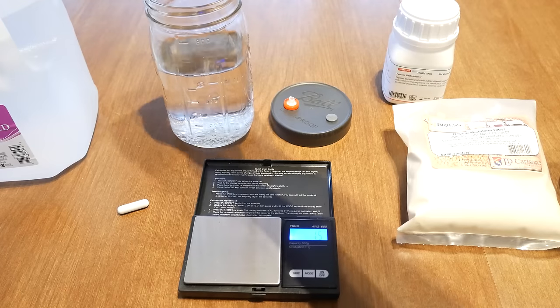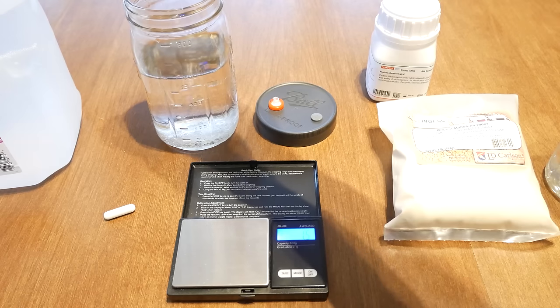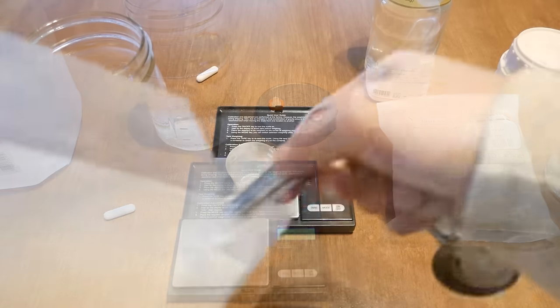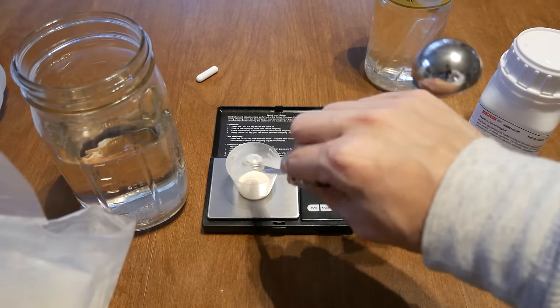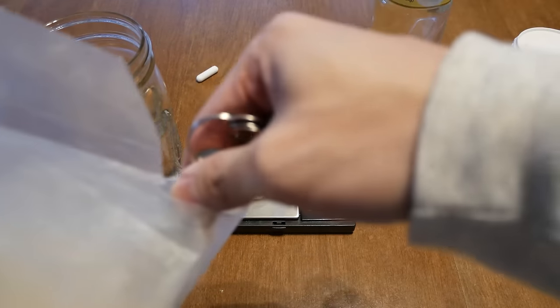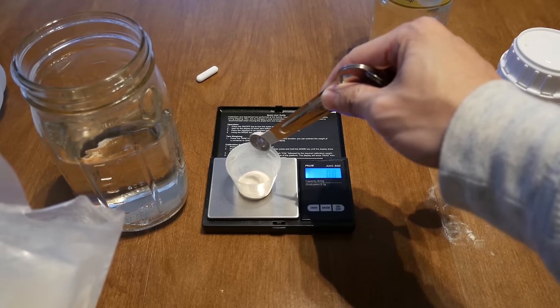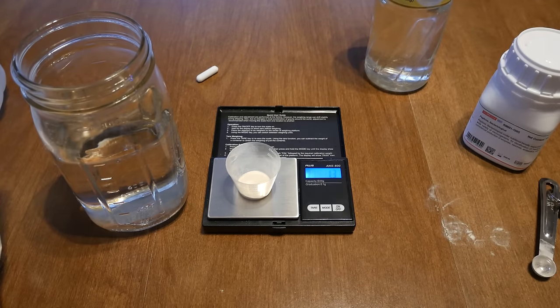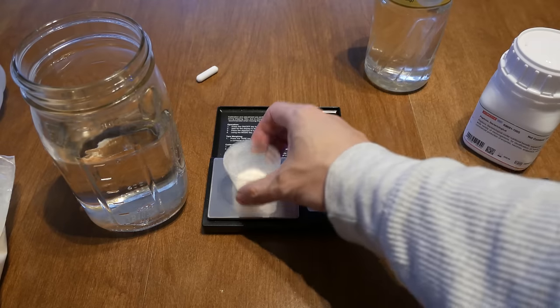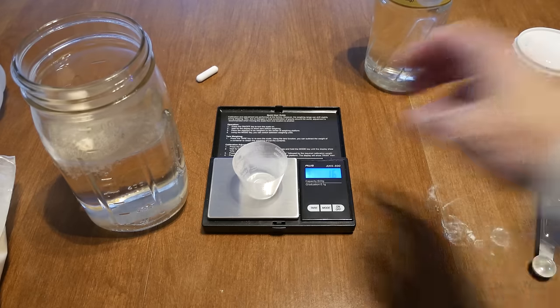After measuring, dump the corn syrup into your jar of distilled water. Next, I'm going to measure out my light malt extract. I'm using a quarter teaspoon — about one and a half quarter teaspoons — which will give you roughly 1.2 grams. Then dump that into the culture mix.